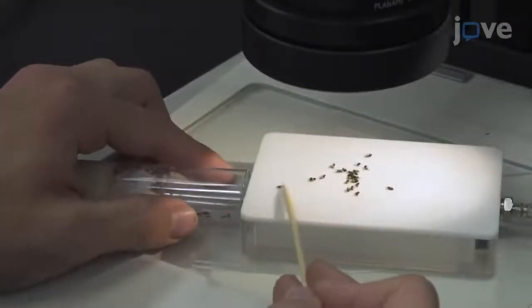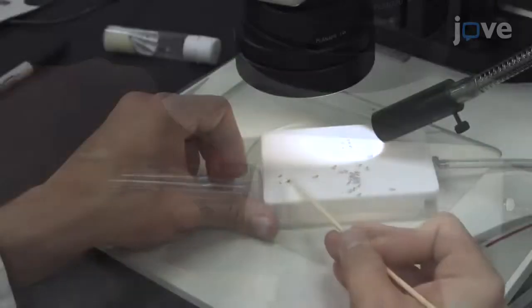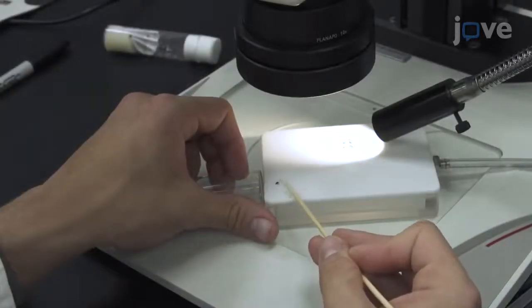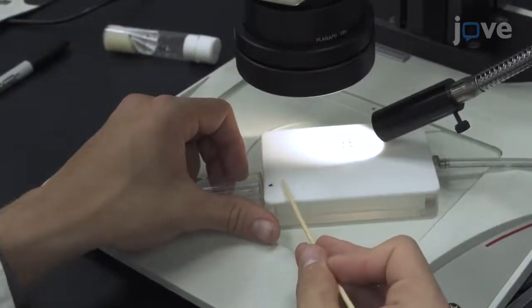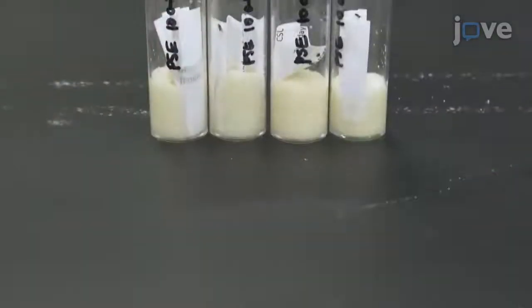To set up the culture from which to collect experimental animals, transfer the reproductive adults to the growth medium using standard methods. Standardize the number of flies per vial and avoid overcrowding the adults.